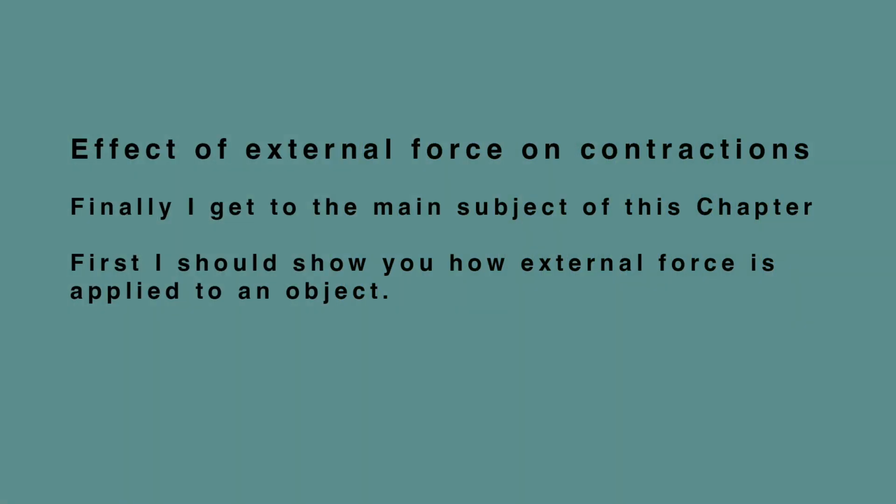Finally, I get to the main subject of this chapter. External force is detected when it stretches or compresses tissue. In this experiment, an instrument pushes on an ampulla to compress it. Pushing an ampulla in a controlled and reproducible way is not trivial. Remember, an ampulla is only 100 to 300 microns, 0.1 to 0.3 millimeters, wide and typically 3 times as long.